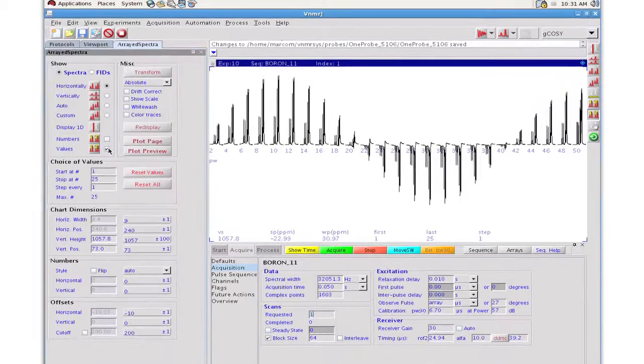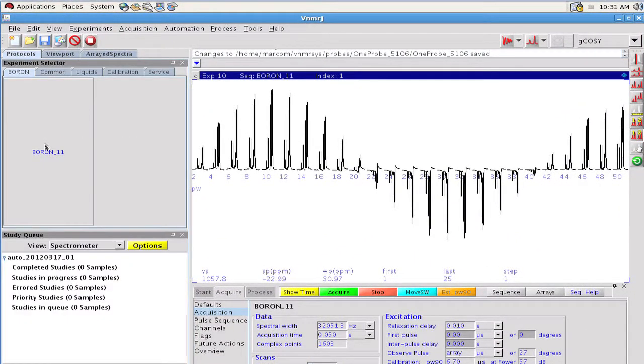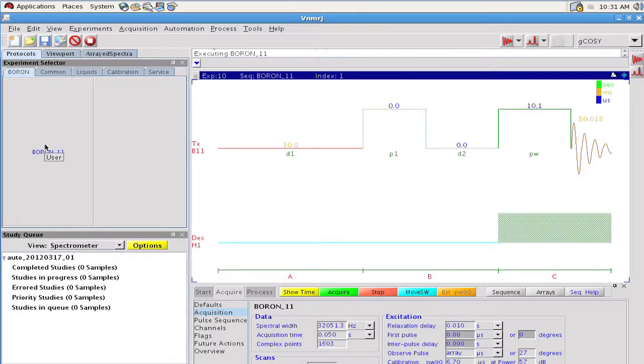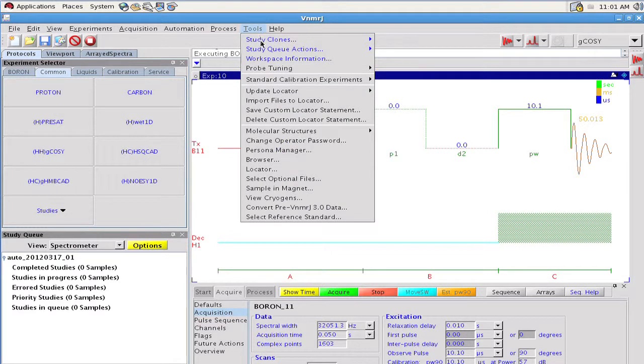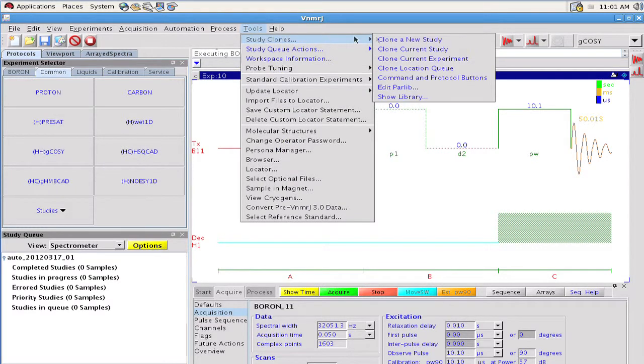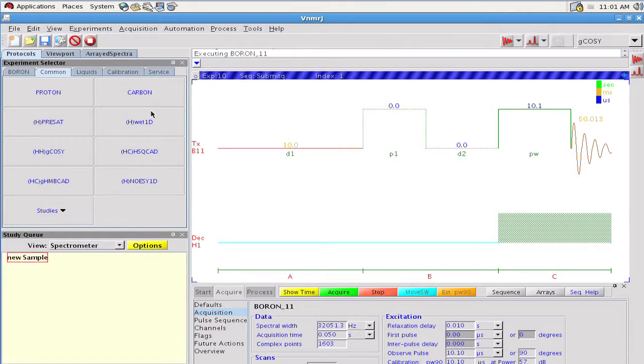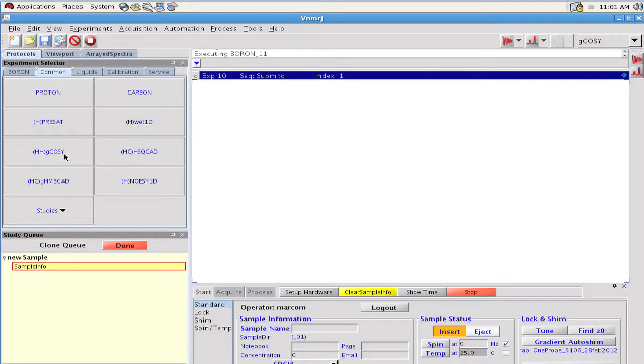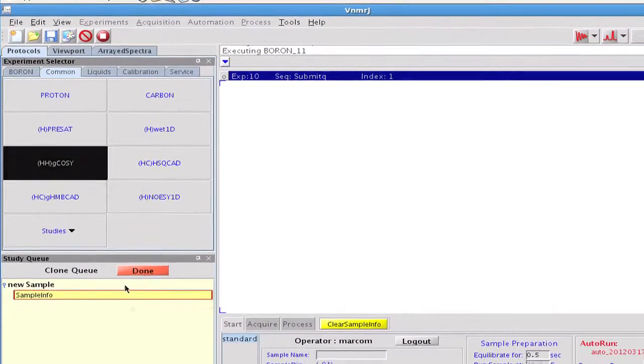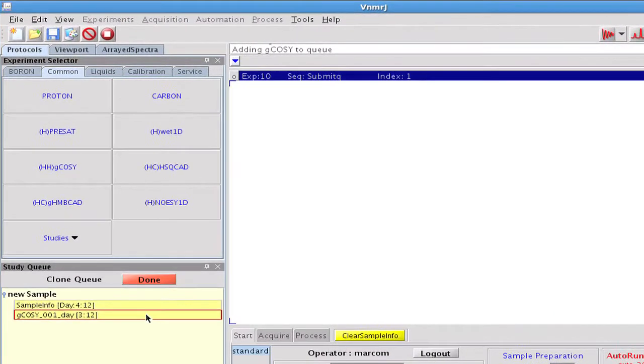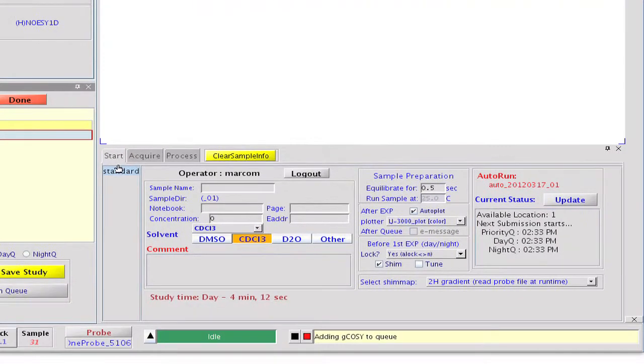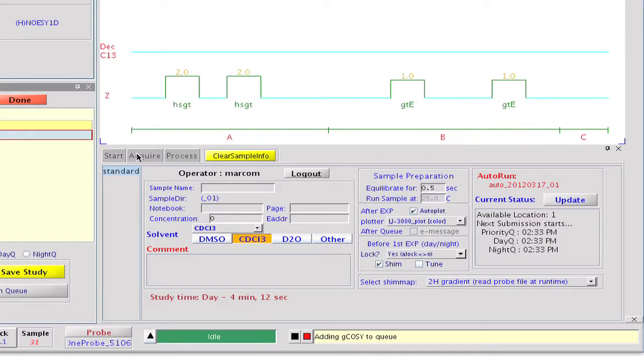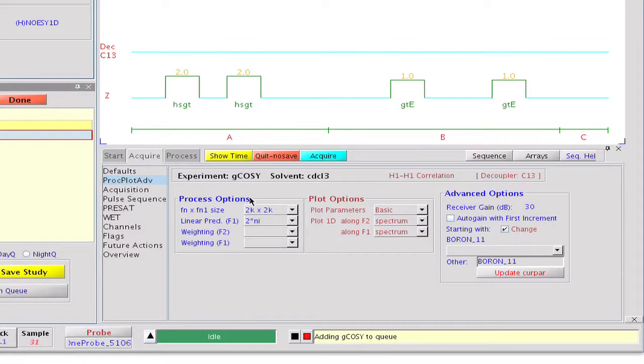This way, the next time we use the boron protocol, we'll get the requested flip angle. We continue by creating a gradient COSY protocol for B11. Our starting point this time is the G-COSY protocol that VNMRJ has by default for protons. We clone this protocol and make it boron compatible. By double-clicking on the G-COSY protocol, the COSY related parameters are loaded to the current workspace ready to be customized.